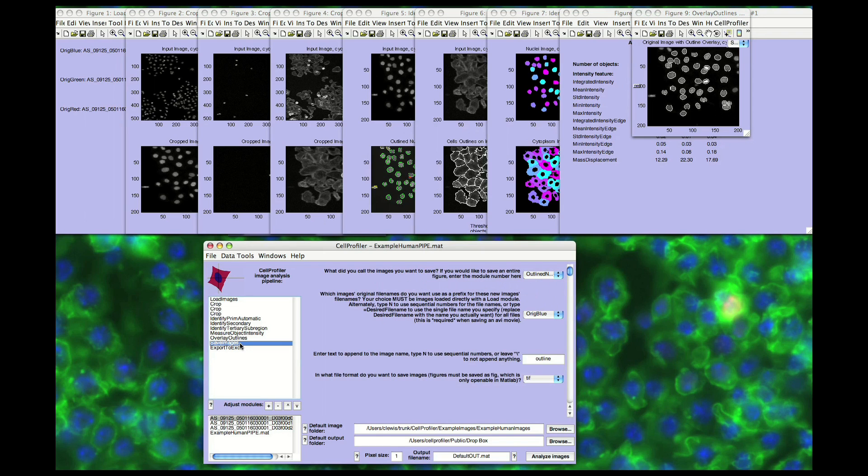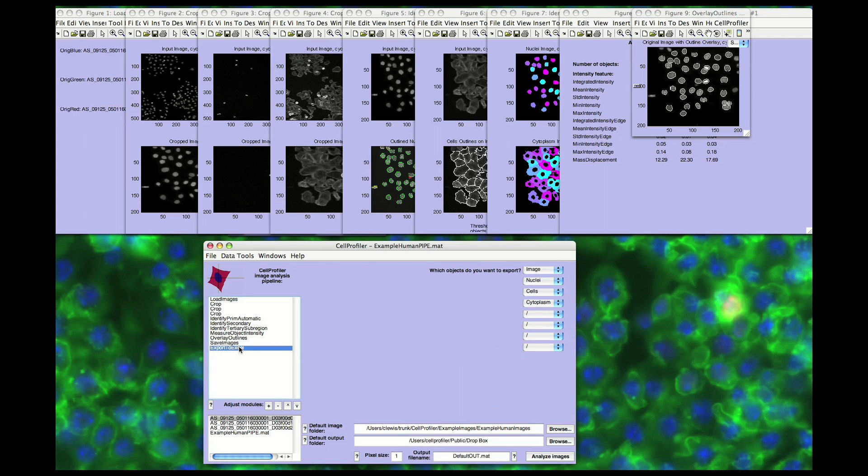Resulting measurements are accessible by exporting to a tab-delimited spreadsheet format that can be opened in programs like Microsoft Excel. The data can also be accessed by using Cell Profiler's built-in viewing and plotting data tools, or exporting in a format that can be imported into a database like Oracle or MySQL.